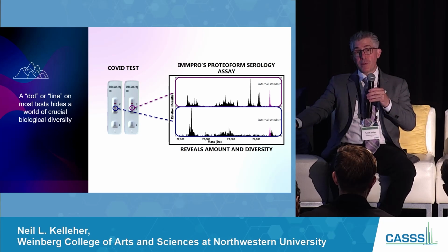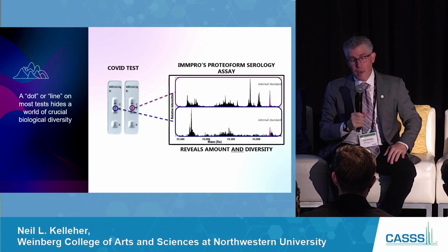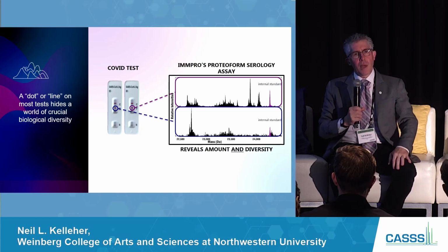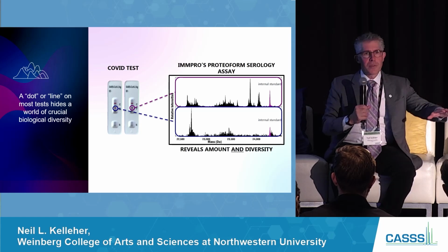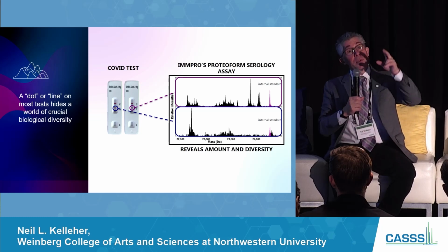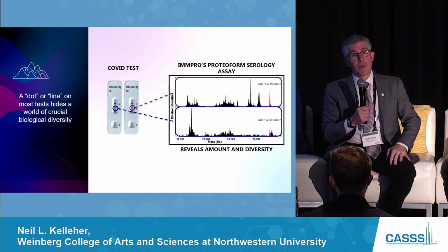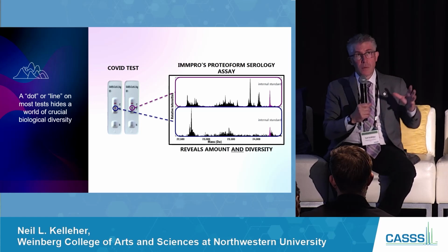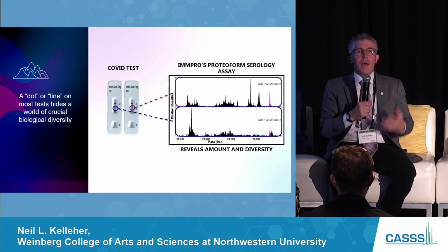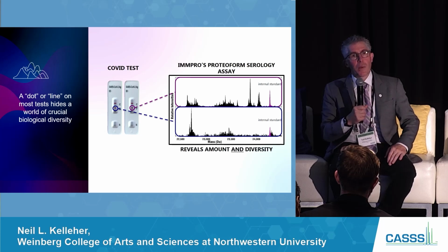We can see it in PBMCs. If you collect 1 million PBMCs, we can see some cytokines in there, cytokine proteoforms. So it still needs to get better. I can't say, well, we've got the answer for autoimmunity, but smoldering disease might be able to be detected in other types of proteins in the blood. I'll just leave it at that. It'd be an indirect way to go about it. But I just think the better your information in proteomics, the more you're going to be able to detect.